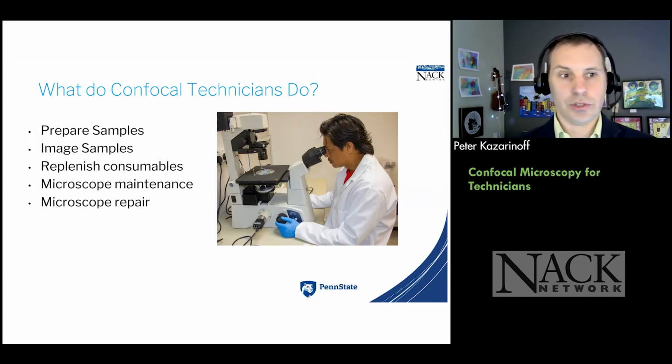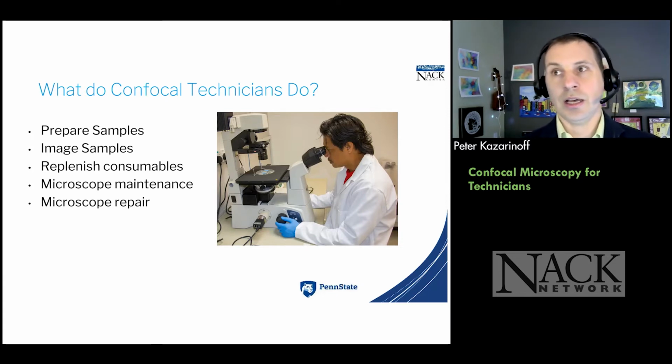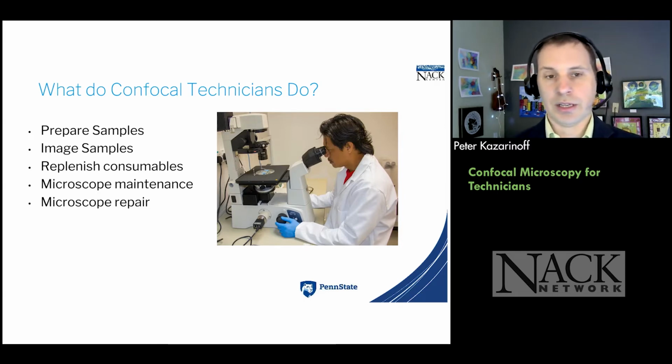We also needed to instruct the students on how to replenish consumables, things like slides, cover slips, lens cleaner, stuff like that. How to do basic microscope maintenance, including cleaning off the lenses, including doing any adjustment of the sample stages, and then also basic microscope repair.